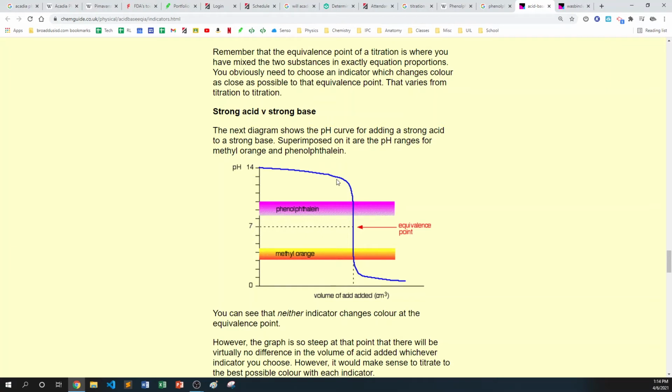So if you're slowly adding acid to your solution, and you see it turn bright pink, and you immediately add the tiniest drop later, and it disappears, then you know you've passed the neutralization point. Does that make sense? So even though phenolphthalein is between 8.3 and 10, it can capture the neutralization point.